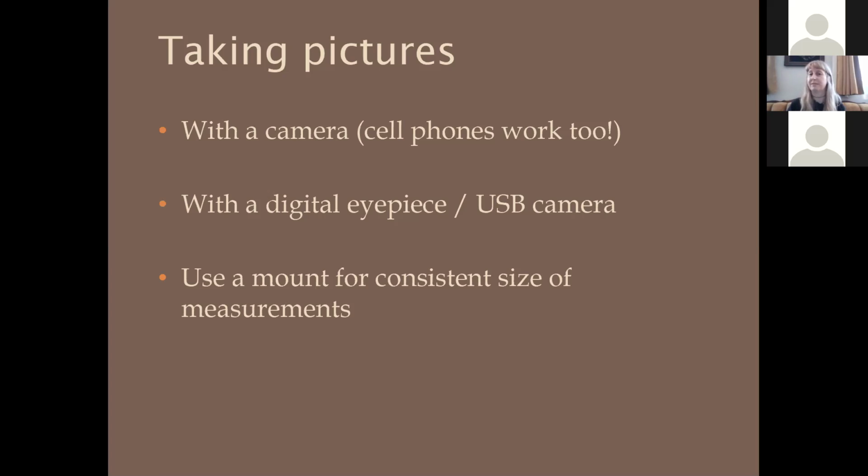So I would definitely recommend looking at the reviews for these things before you go buying a USB camera. And I have heard similar reviews from other people who have bought USB cameras that they are generally not very good quality. So make sure you look for those reviews.